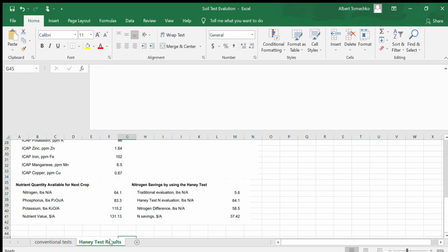So you have a little bit of a difference there, obviously, but as we know with variability, as we know with the increase, this is 4.6% organic matter. The other test was 3.7. So that alone, of what we know about nitrogen, probably would have driven this number up. This test came back at 3.7% organic matter. I have a funny suspicion that the nitrogen difference would have probably been larger, right? Nonetheless, this probably would have been lower, though, I would imagine.